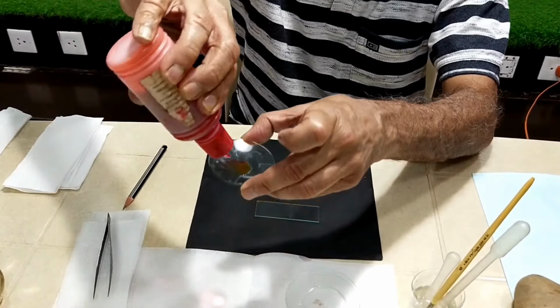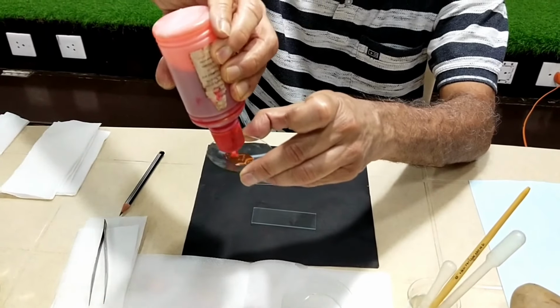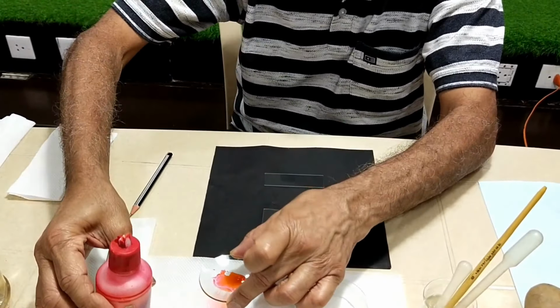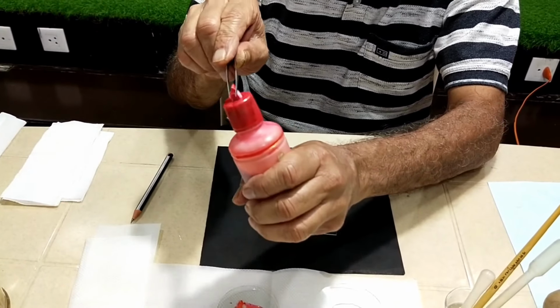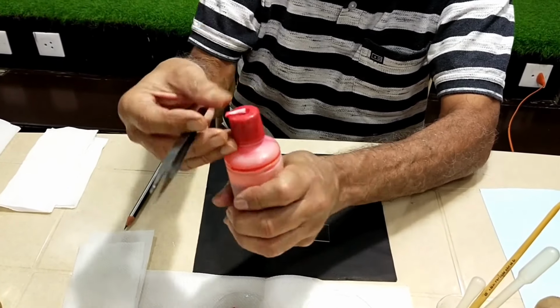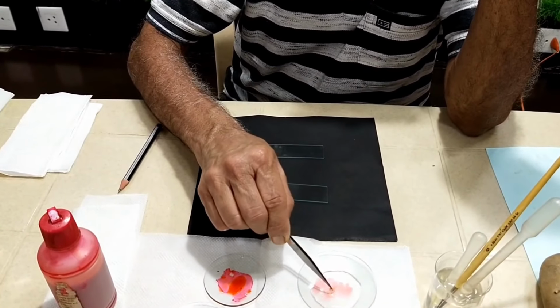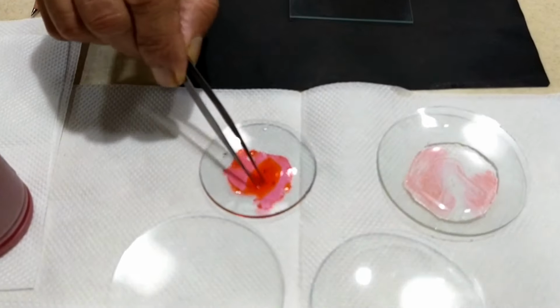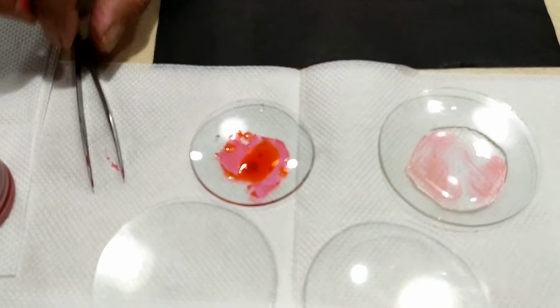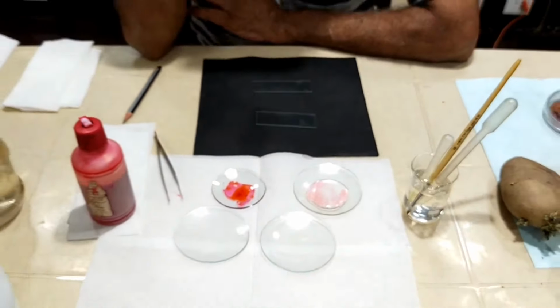Shake it and shake it. Okay, so I'll just put back the lid and keep it away. I'll just put this skin piece here. I put this in stain. I'll just leave it for a few minutes, and then I'll again give a water wash, and then let's see what happens. See what is happening now.